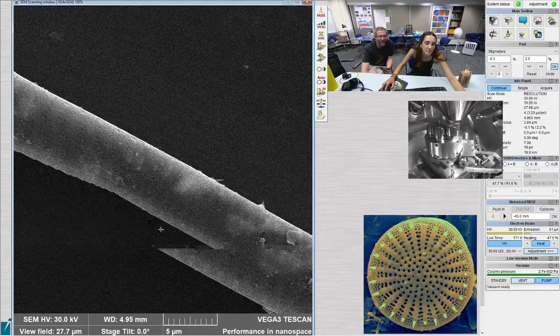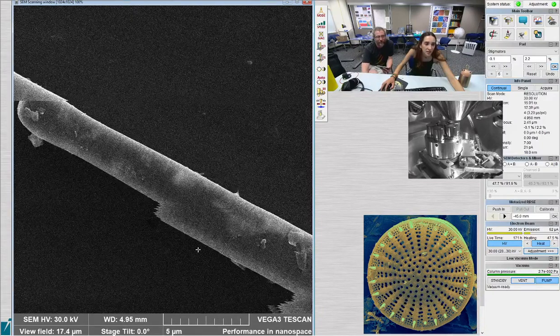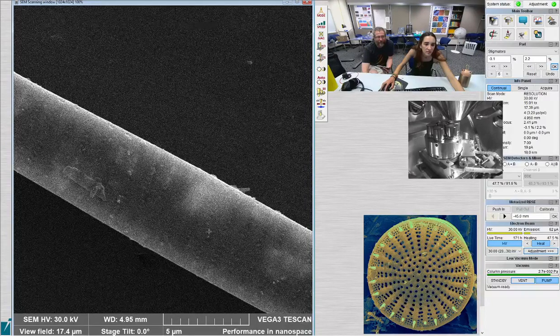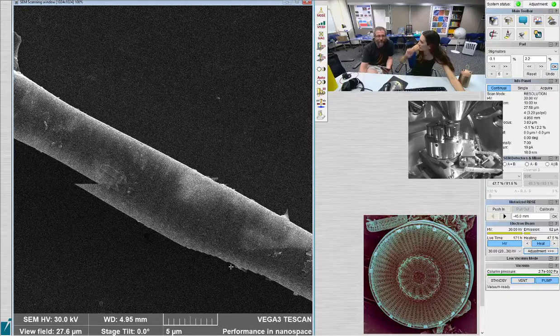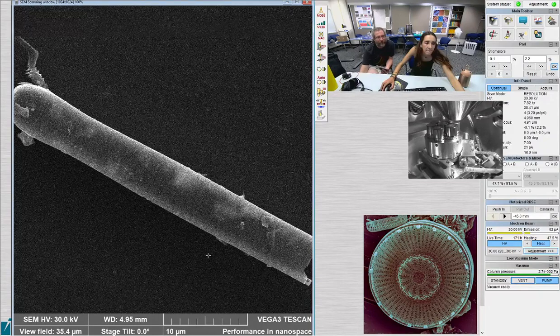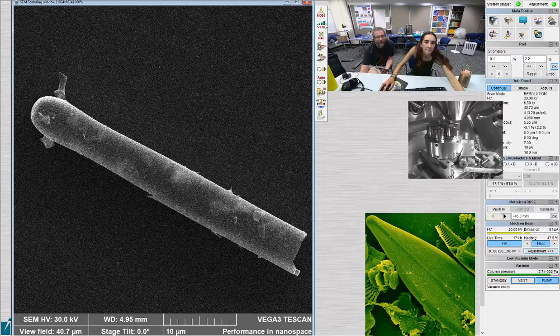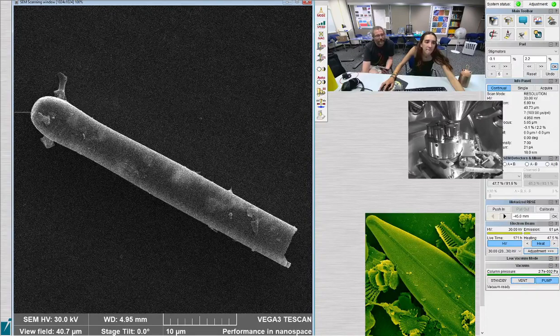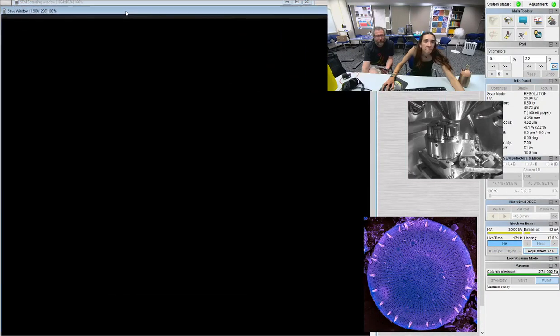Yeah, it looks like a fragilaria. Those are some pores. I think that's a diatom. It has a diatom feel to it. It's ulnaria, though, not fragilaria, because they match up across. There's actually a sternum, but the stria match up across. They aren't offset. It's just a little fragment of an ulnaria. Yep. Pretty sure.